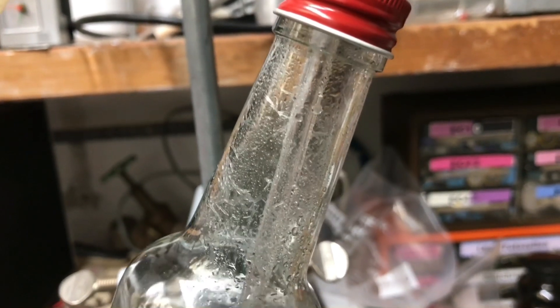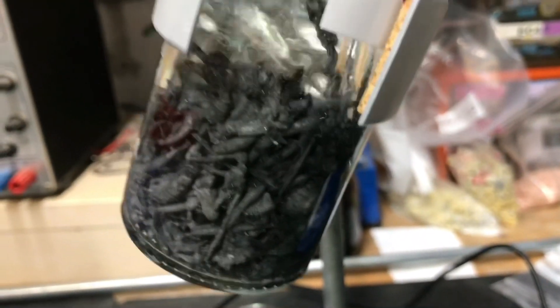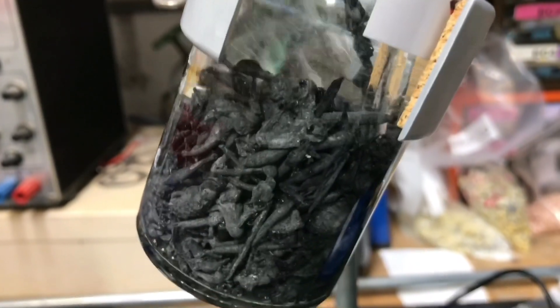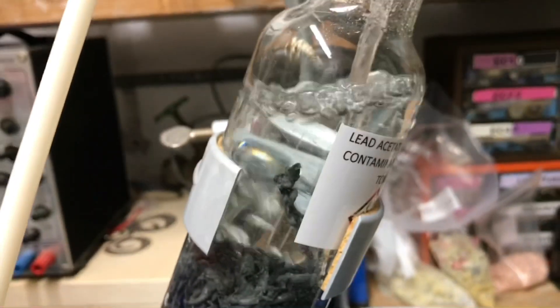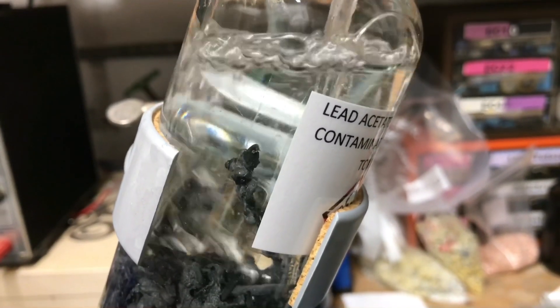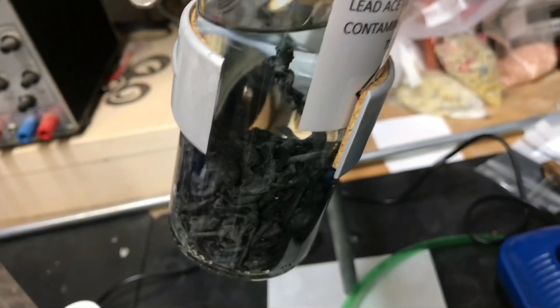A few days later the lead acetate looked like this — a few crystals had already settled on top of the makeshift gas bubbler, and you can see that a little lead has dissolved. While filming, even more crystals had started to form, so I decided to add more water and acetic acid. Now it was time to take out all of the solution, boil it down, and let it crystallize. A syringe was used to suck out the lead acetate solution from the bottle.